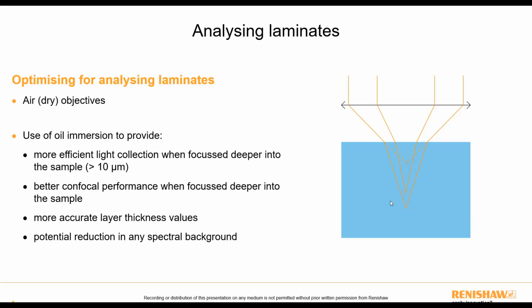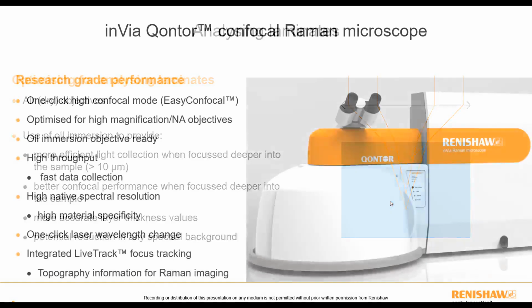So oil immersion might sound quite complex. It's really straightforward to perform, just using the right objective, putting a drop of oil between your sample and the objective, and then you physically immerse your objective into that oil.